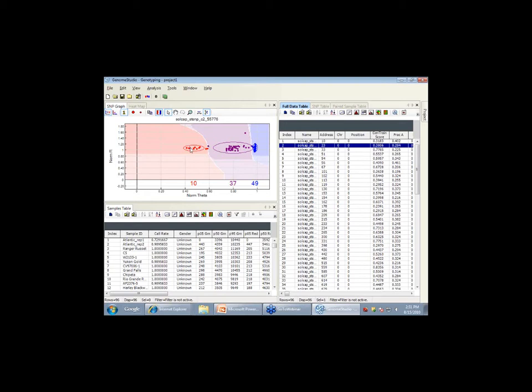The clusters that are in the red are what's called the AA genotype. And the A genotype is actually the first genotype that we gave it. When we define the SNP, we give it a sequence and we say this is a CG SNP. The A is the C, the B is a G. But you don't have to remember that because it's all in these tables, which I'll show.